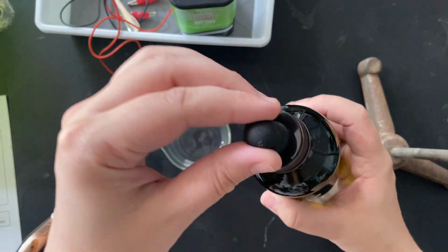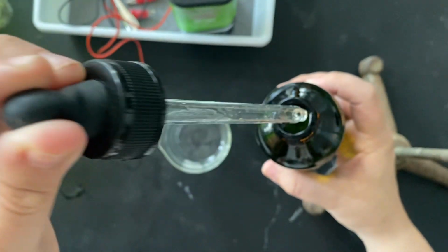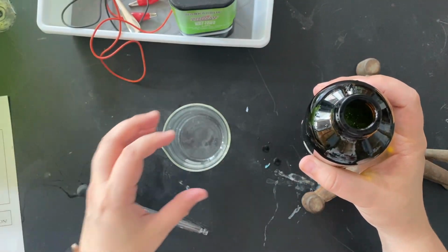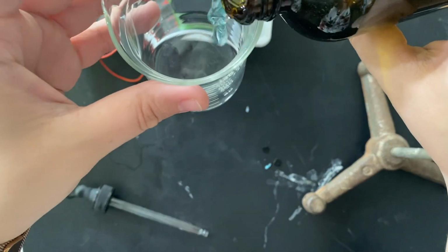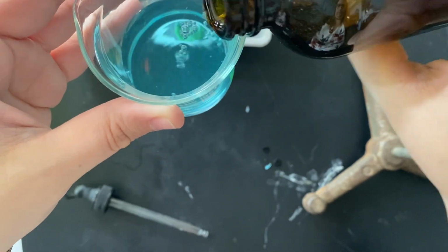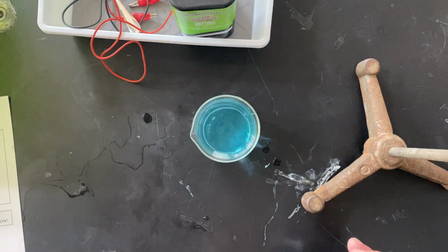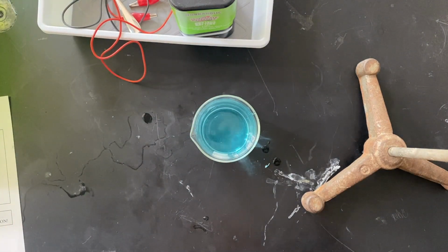Now the bottles do have little droppers. Ignore it, you do not need it. You will be here for 500 years if you use the dropper. So just going to pour in about 80 mils of your solution. So it is a nice blue color, which is because of the copper.